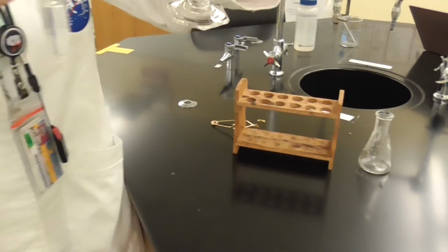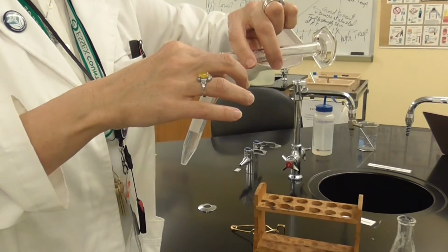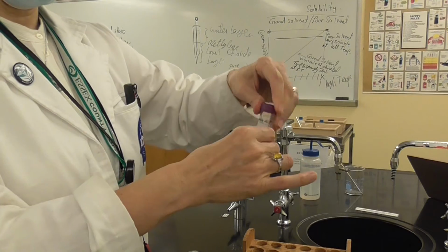So that's the third time, right? Yes. We're adding another 2. Can you see? Another 2 mil of methylene chloride. That's the last addition, right? Mm-hmm. And then we're going to do the same thing.